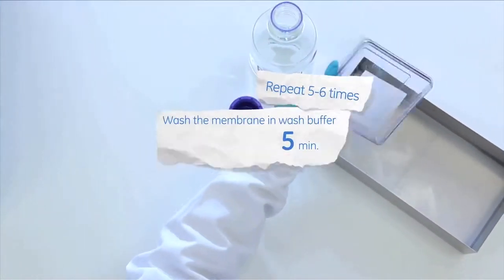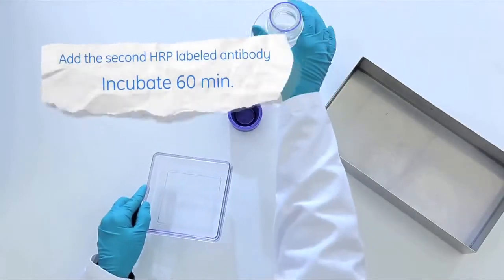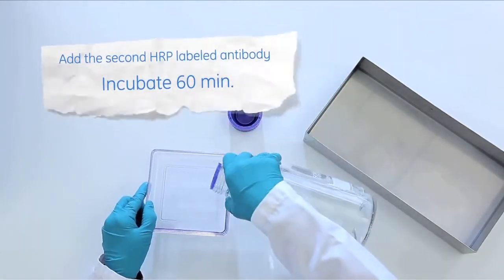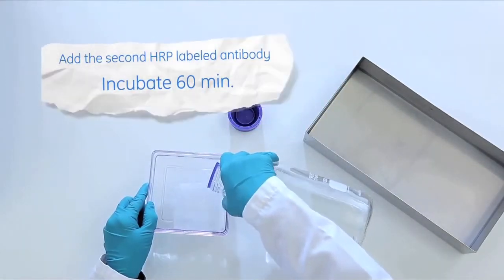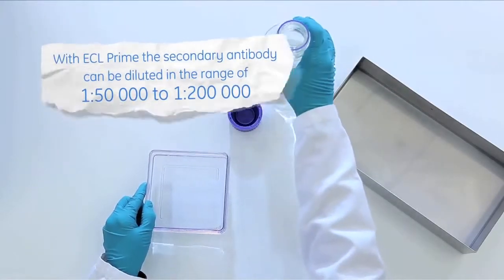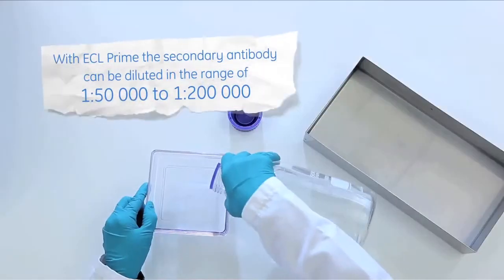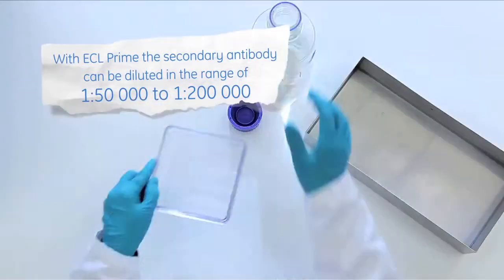Add the second HRP-labeled antibody to the membrane and incubate for 1 hour. When using ECL Prime, the secondary antibody can be diluted in the range of 1 to 50,000 to 1 to 200,000.